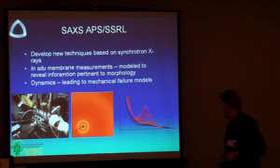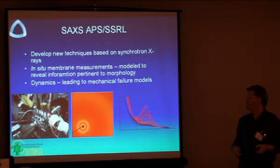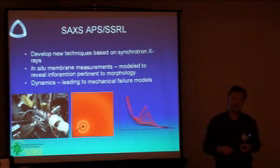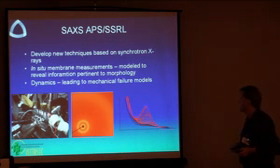Briefly, what we're looking at, we are very fortunate to have a program at the Advanced Photon Source. We have 36 shifts. We've used 9 of them so far. And the Advanced Photon Source enables you to collect an X-ray scattering pattern in 2 seconds. You do the same experiment on a rotating anode, it takes an hour. So this basically allows us to do dynamics.